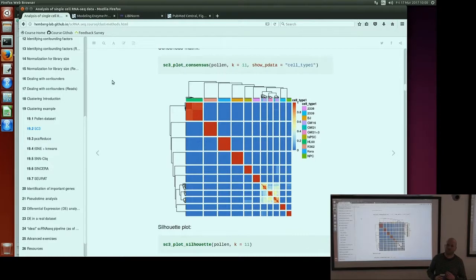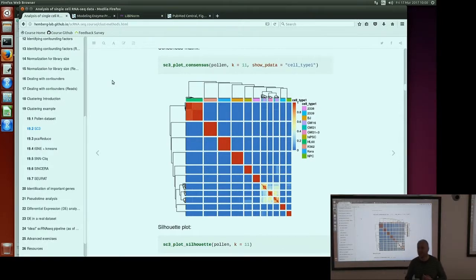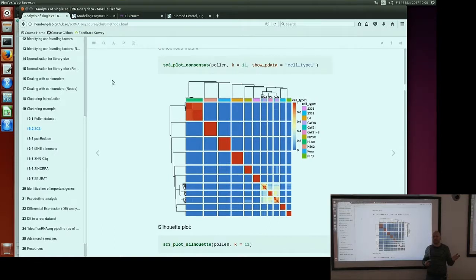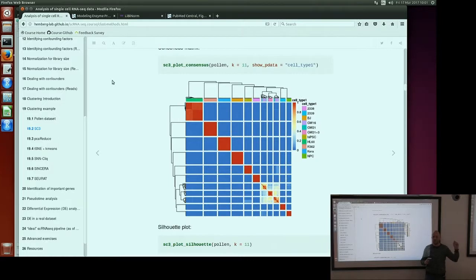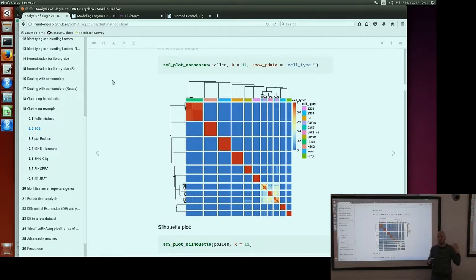The k from 2 to 5 was just random numbers — I didn't know how many classes I had in the dataset. When you open the interactive session you will see that your k is 11. But if you ran SC3 from 2 to 5, you can change k from 2 to 5 and it will show results for each k separately, so you can explore different k values and see which one is the best. We identified k as 11 and know there are 11 cell types, so I didn't run it for more than just 11. But you can run from 10 to 12, for example, and see how they differ.